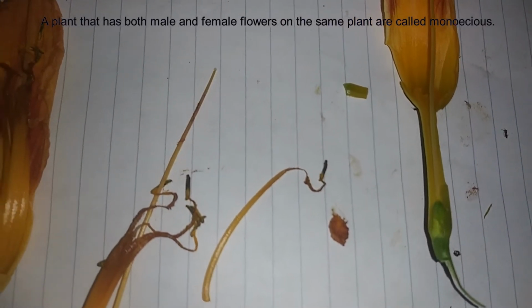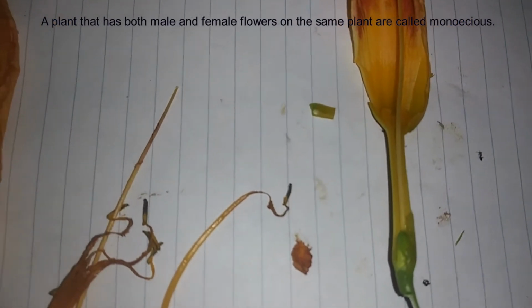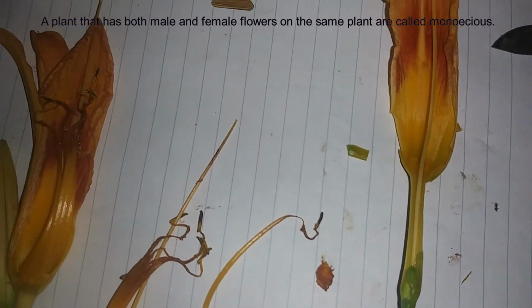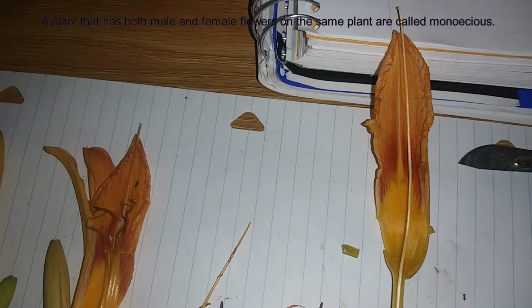Now, this is where we get into some very big words that I may or may not be able to produce, even though I know what they mean. A plant that has both male and female flowers is called monoecious. And they have both male and female flowers. In this case, our daylilies have male and female parts.